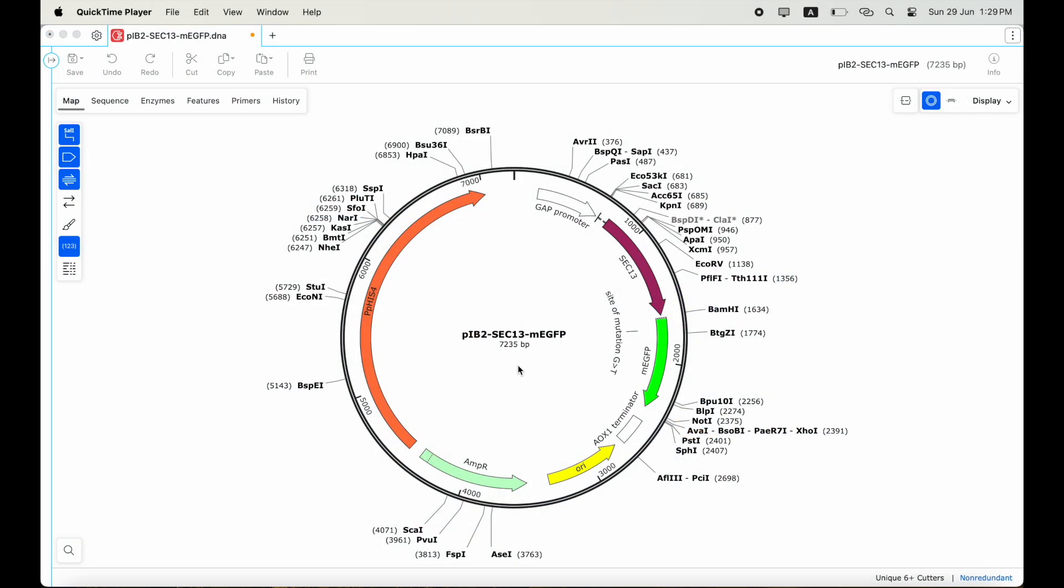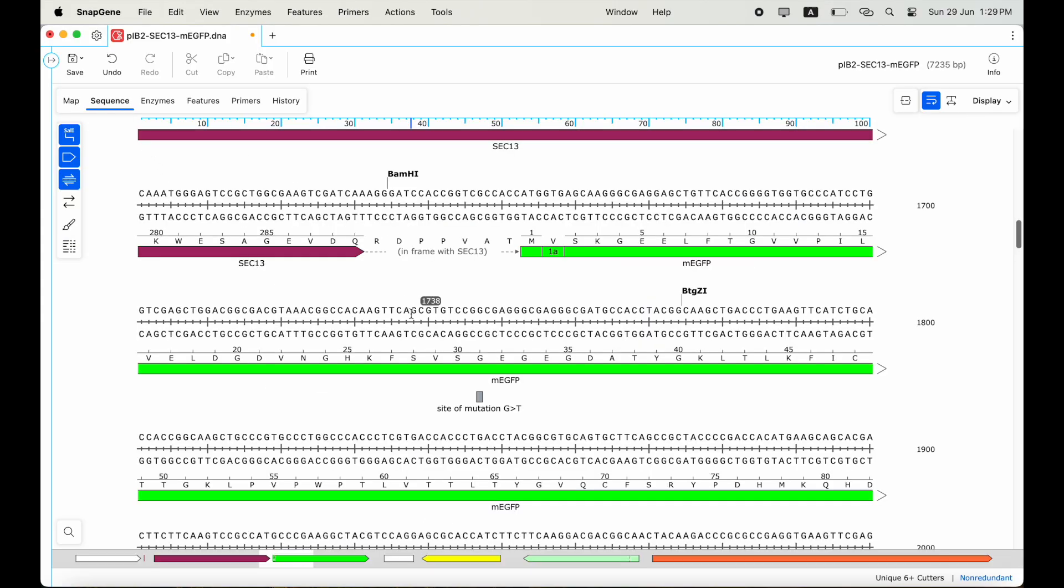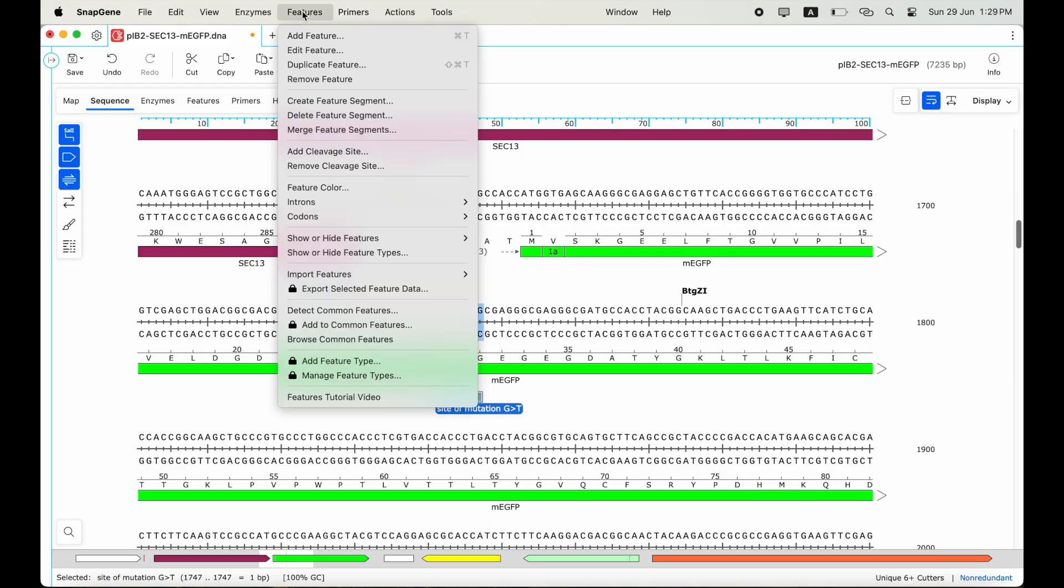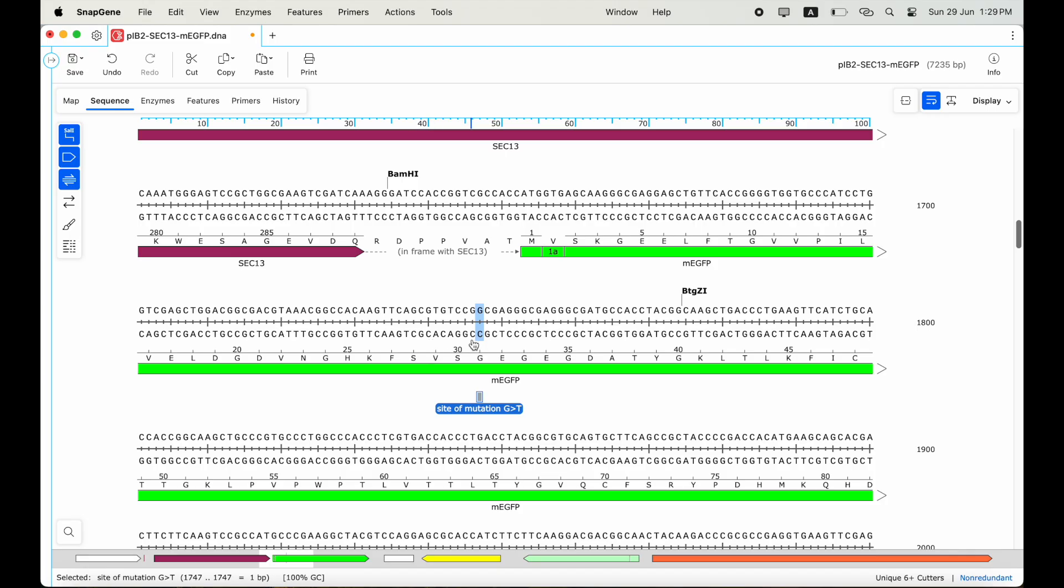Designing primers can be easily done using SnapGene. Let me show you with an example. I'm going to use a commercial GFP plasmid for this example. The first thing I will do is identify the position of my intended mutation, which I have already done and highlighted. What I did was selected the base and added a feature so that I can keep track of it.